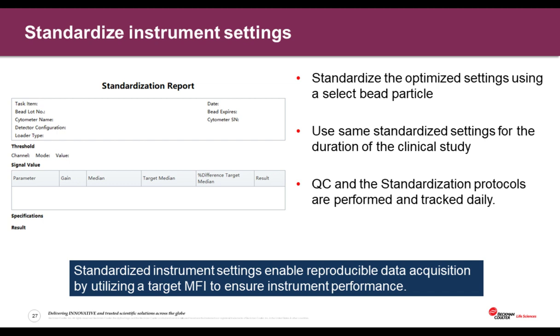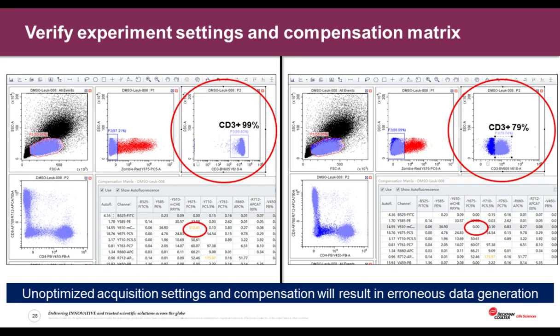The reason for this is that standardized instrument settings enable reproducible data acquisition. And this, again, is important for us because we want to ensure robust development of methods, especially when it comes to flow cytometry, so that we can progress therapeutic developments and bring them into medicine.